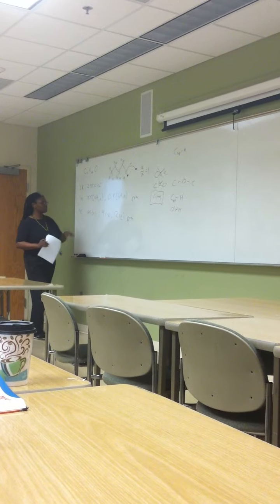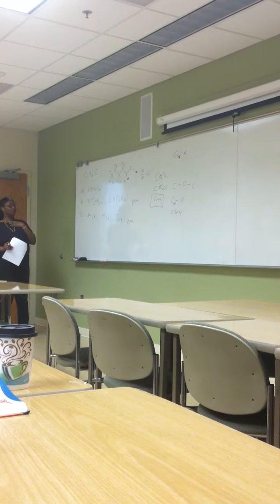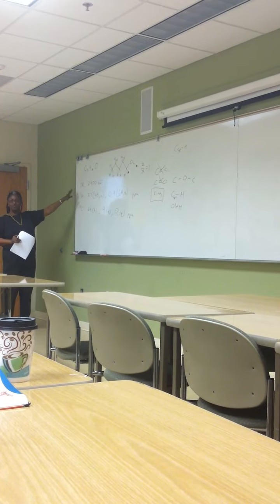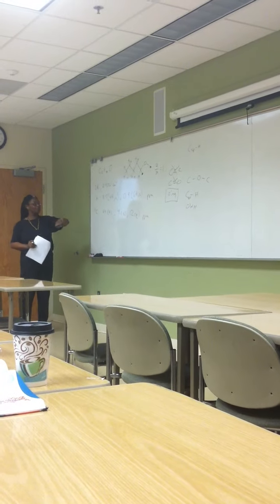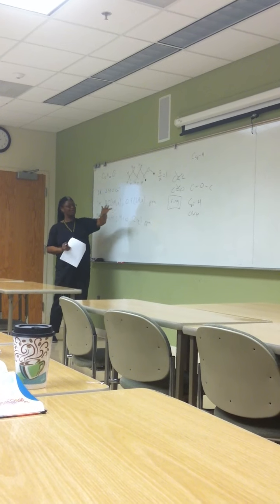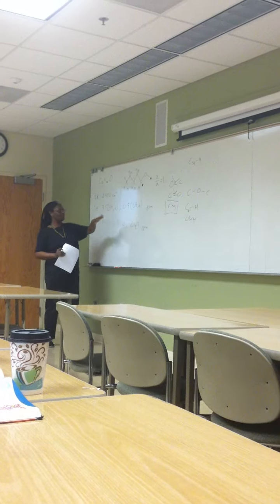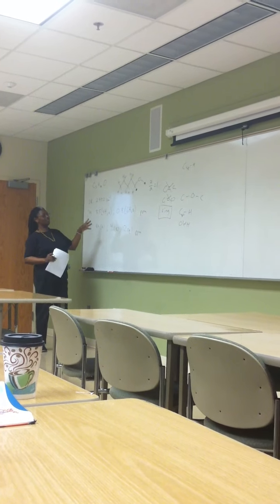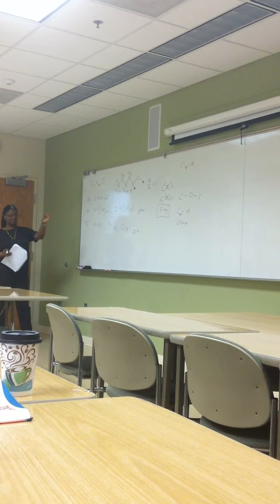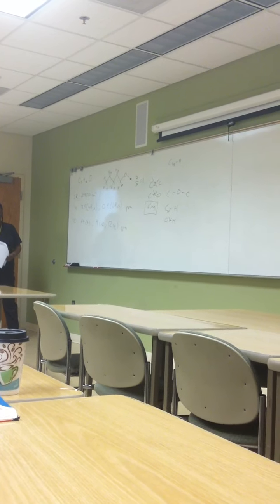And so usually when you look at proton, I usually look at proton first rather than carbon just because I'm more comfortable doing proton NMR. I've done it more. So I usually look at proton first, and then you look and see if you have one that's only a slight shift, so small shift and large. Here we don't really see any larges, but we see the small. We look at our proton NMR. What gives us a shift less than 1?